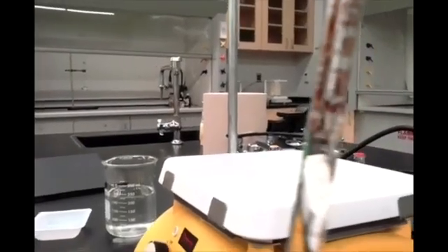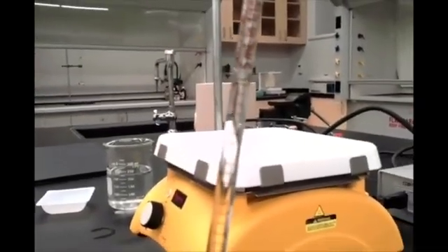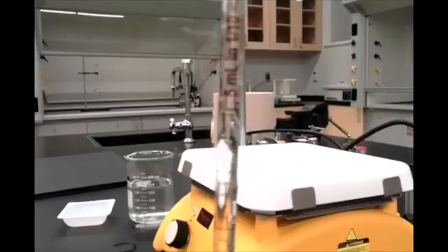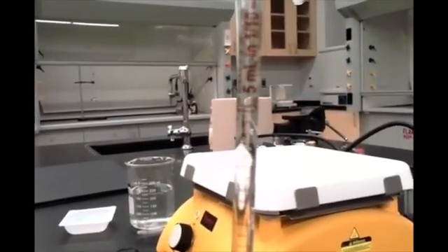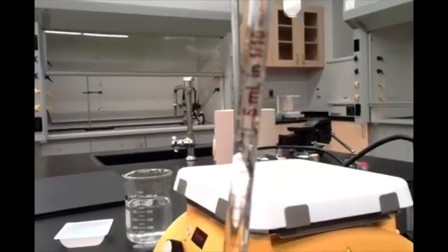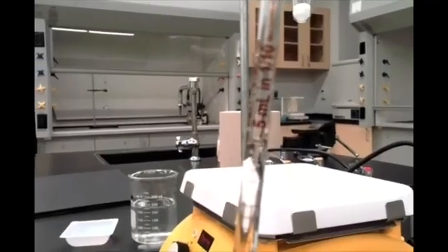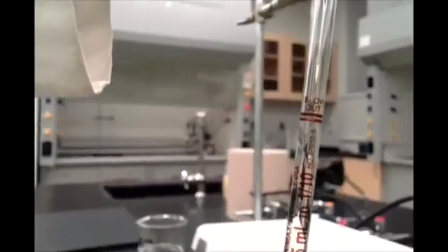I'm going to have a little trouble getting that exactly right, and I'm sorry if this is hard for you to see with it going in and out of focus. It's going to be hard to get this exactly where I want it. Actually, that's pretty close, but we can do better. So I'm going to do this manually with my hand. I'm going to pull this past the mark.